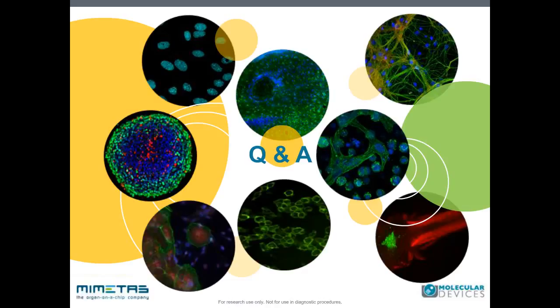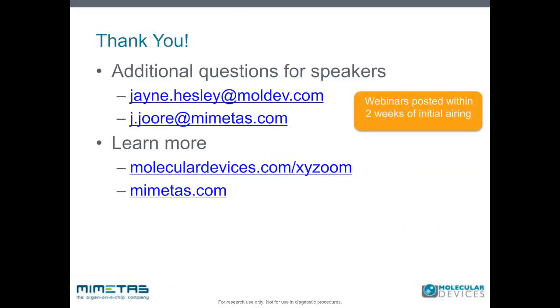Yeah, that's great. And thank you, people, for taking the poll that was coming up. Also, another question was, how long can you image cells for the live cell assay? You may be able to answer in your experience, but I can tell we've had customers report they're doing 5-day assays, keeping the cells alive in their plates in the instrument that's equipped with environmental control. If you have anything to add, you can go ahead. I don't know if you've done long-term live cell assays inside the ImageXpress.